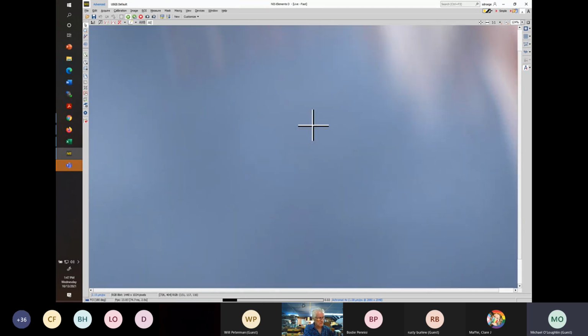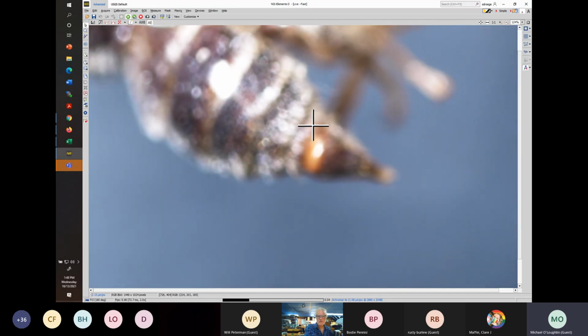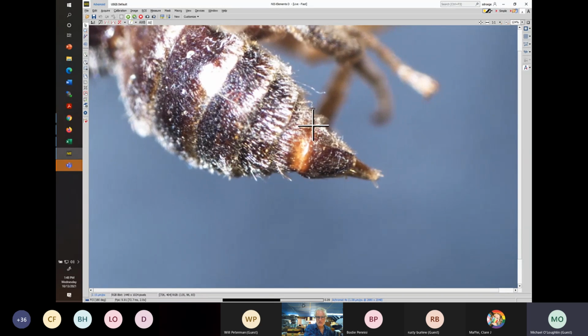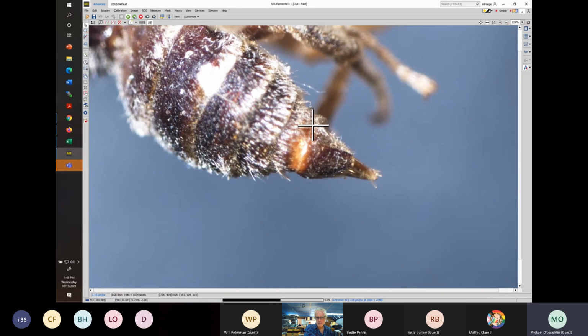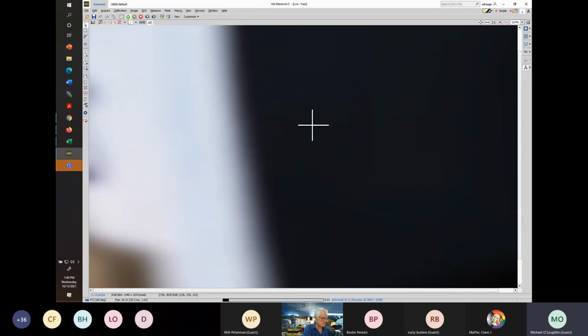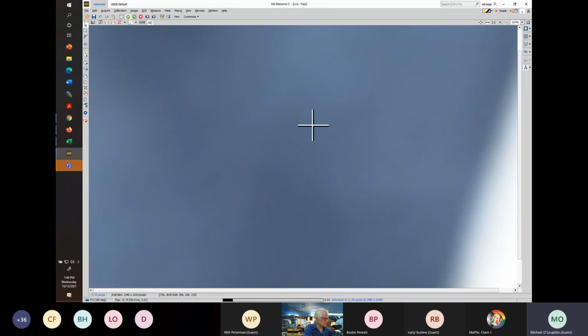I'll just look at its back end a little bit more. And it does not have that weird converging and diverging face. But that's a pretty interesting end. And again, because I don't have specimens, these again came from the Smithsonian. I don't know. That's from New Hampshire, it turns out, whether these are indicative or not.